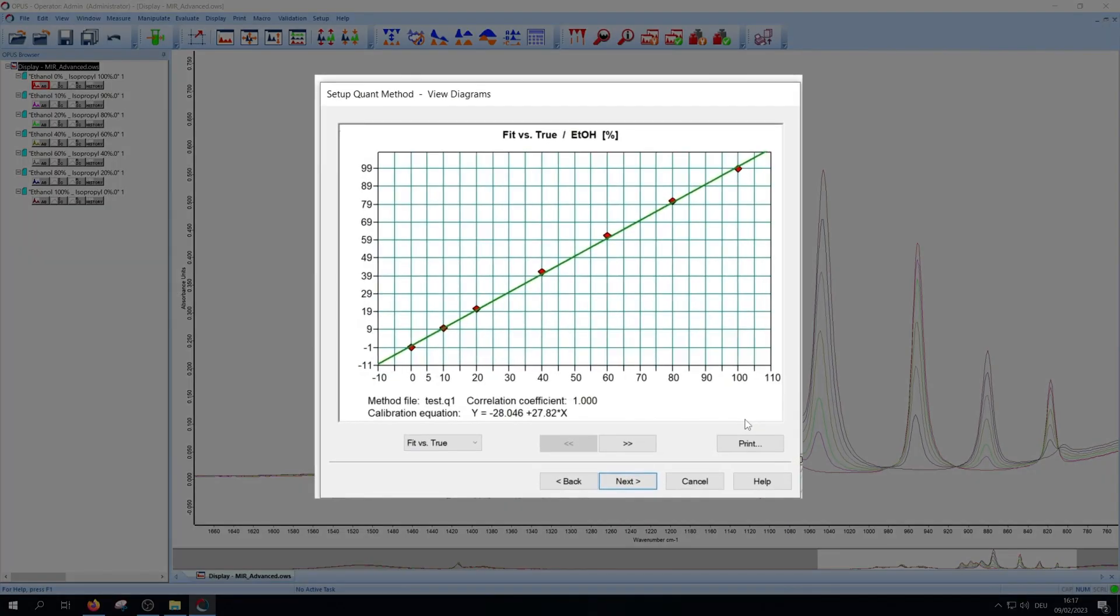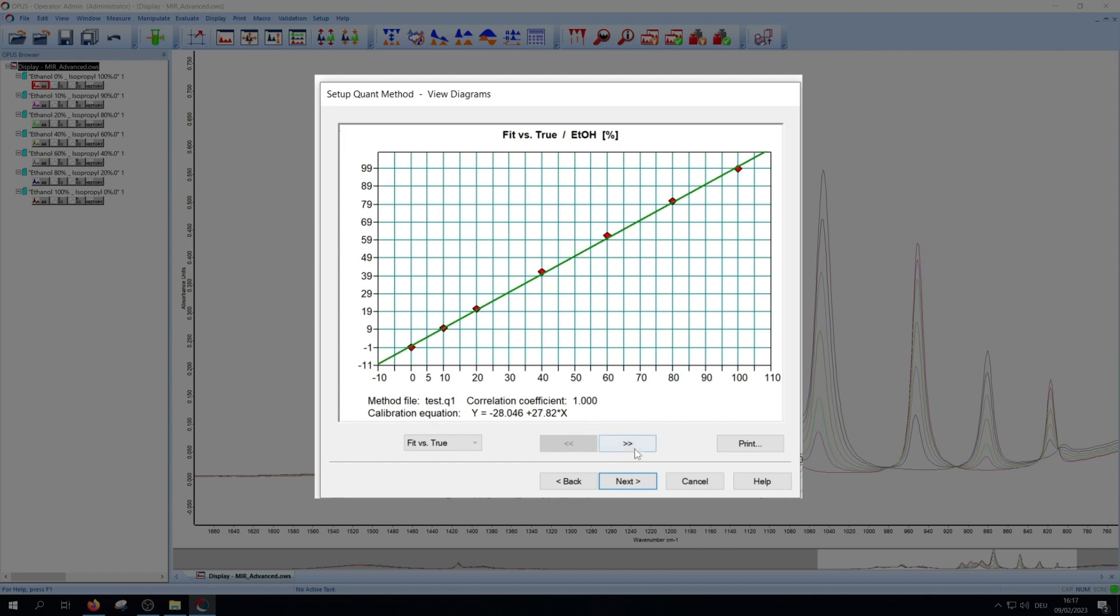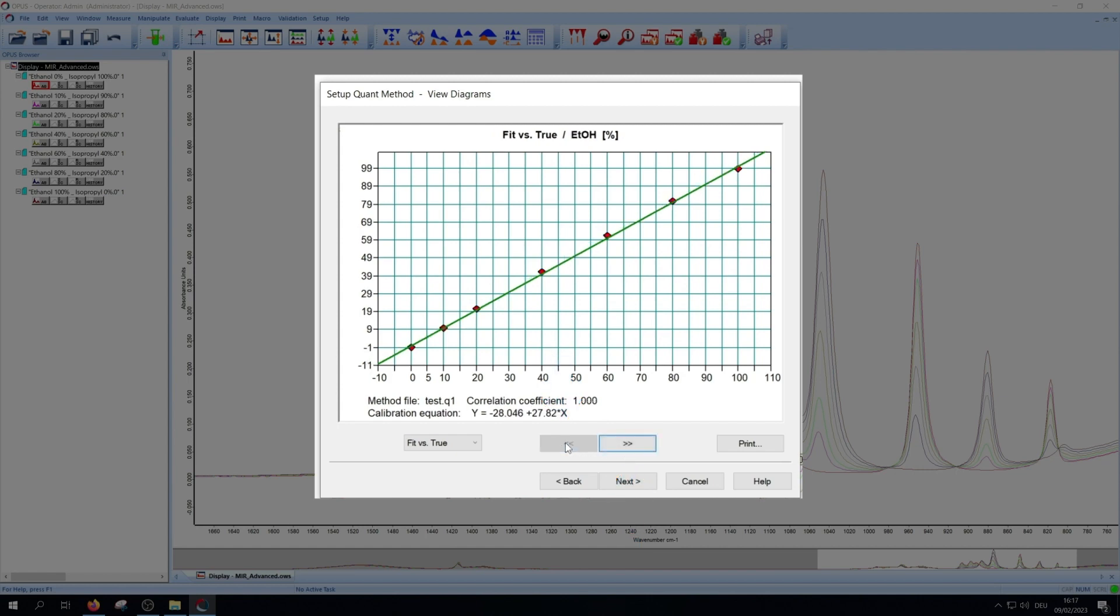You get a fit of your experimental data. Important here is the correlation coefficient. It should be as close to 1 as possible. Via the arrows you switch between the components. You can print this for documentation.